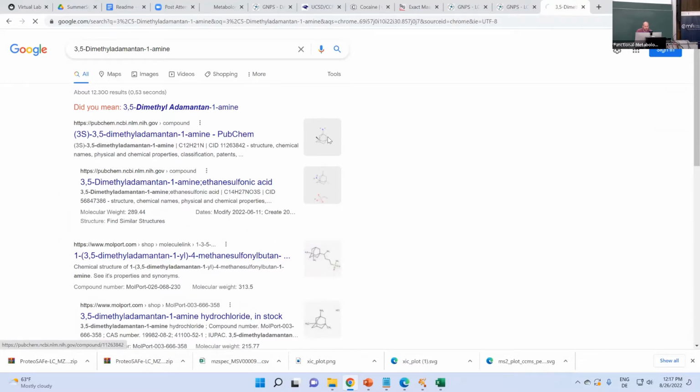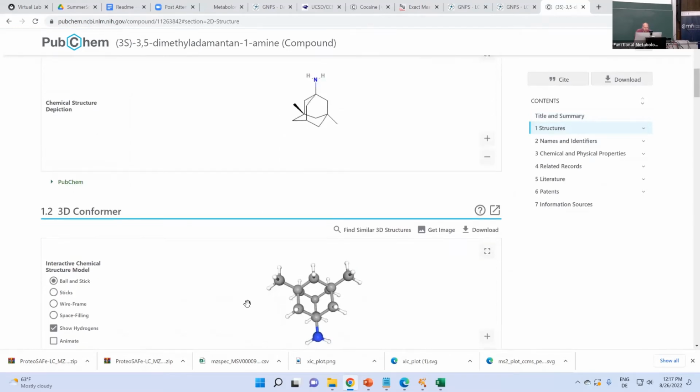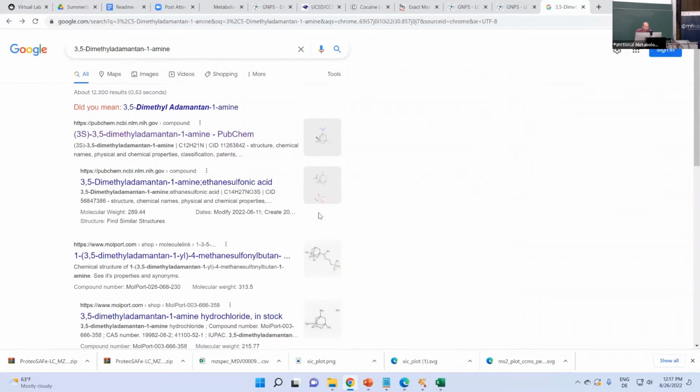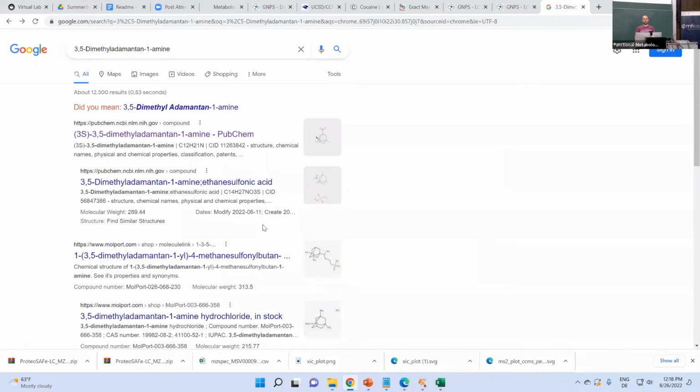Interesting. So that looks like an alkaloid. It has a weird structure, I don't know. It's awesome if I can find any context. Often Wikipedia entries are quick reads, and if this is a common herbicide or so, then it's likely that you will find something on Wikipedia. Obviously, if I don't find much information here, I can in a second step go to Google Scholar or SciFinder and mine more in the scientific literature. But I think for compounds that are widely known, you will get good hits in Wikipedia and so on.